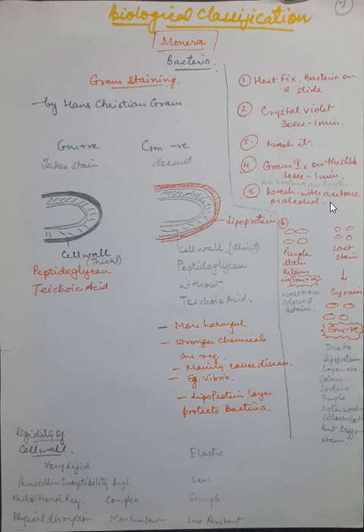So we will wash it. We will take this 90% alcohol or this acetone, which helps in the washing. What is observed is that all these bacteria turn purple here, and after washing with the acetone or alcohol, what we observe next is that some bacteria retain this purple stain, and the ones in which it is retained are called gram positive bacteria.